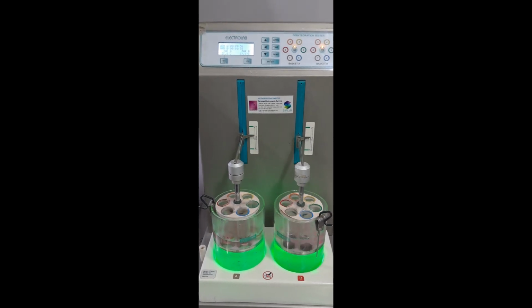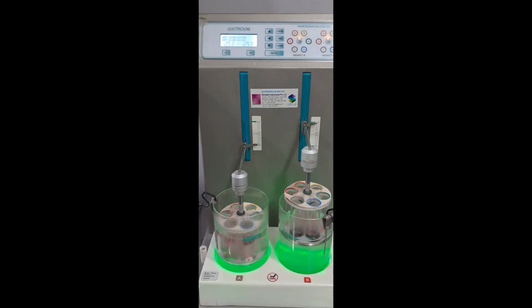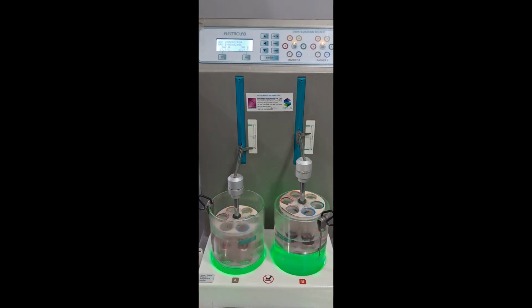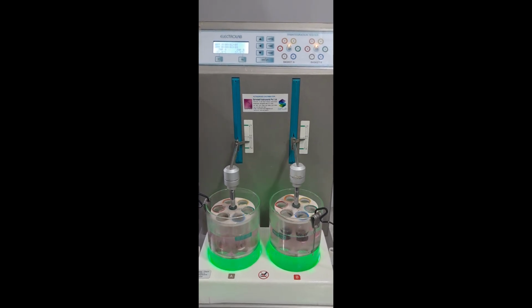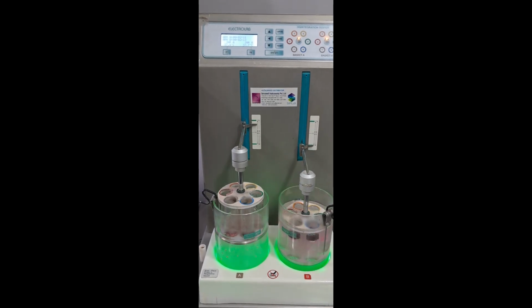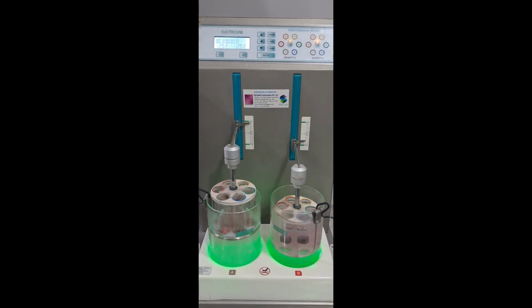10. Operator training and SOPs. Document step-by-step procedures for setup, run conditions, endpoint checks and cleaning. Train technicians on common pitfalls, for example, air bubbles under meshes, misaligned tubes. Some important questions and answers.